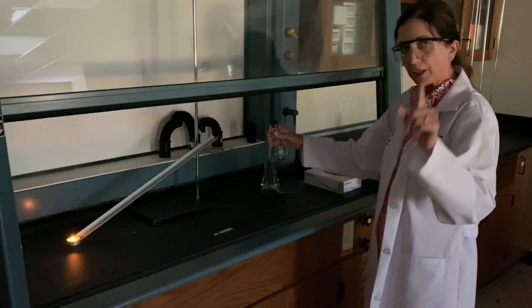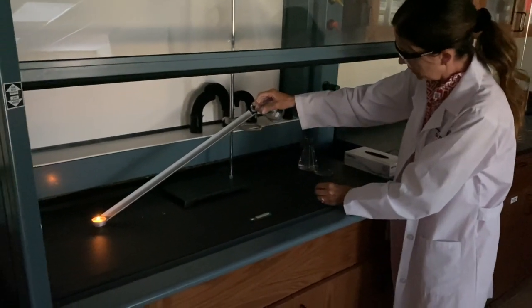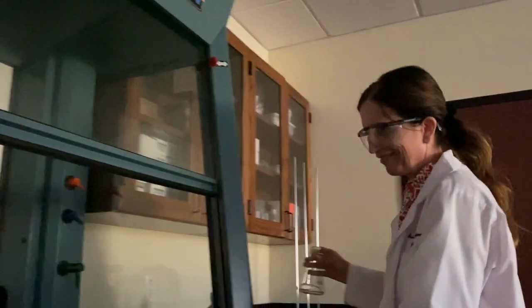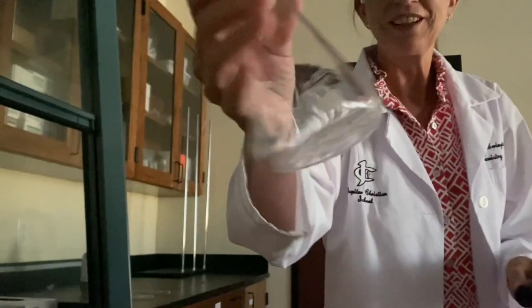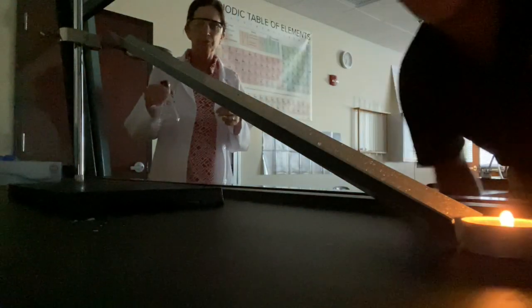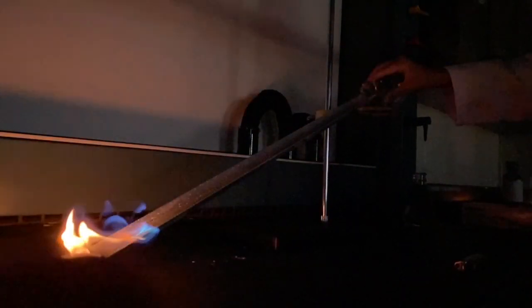So now I'm just going to tilt this bottle — I'm not pouring any liquid down the ramp, I'm just tilting the bottle, and watch what happens. Oh my goodness, that was crazy! The liquid's still in there. What happened? Let's do it again — make sure she doesn't cheat, no liquid coming down. Wow, that's crazy! The vapor is so heavy that it flows down the ramp and ignites the flame because it's more dense than air. So even though no liquid is pouring down the ramp, it is the vapor that is igniting.